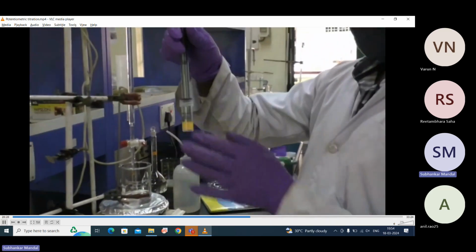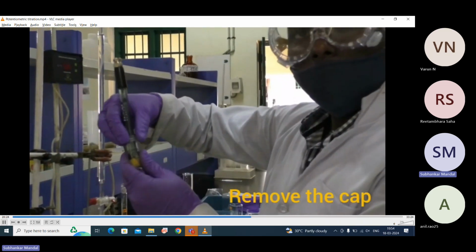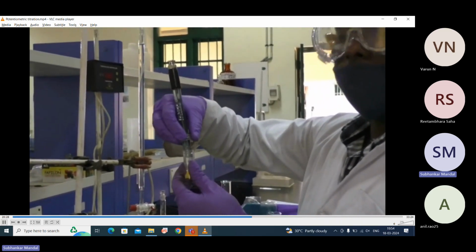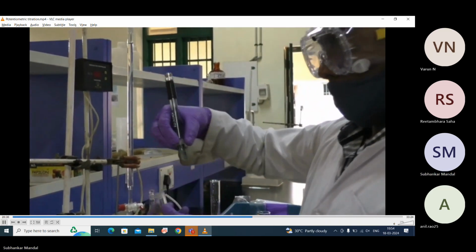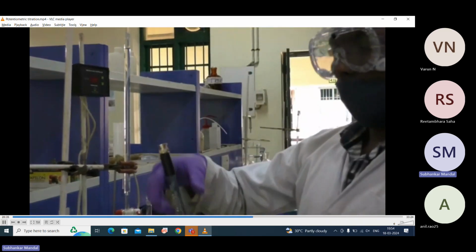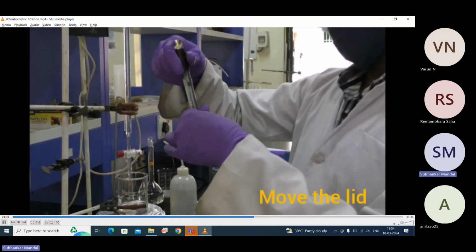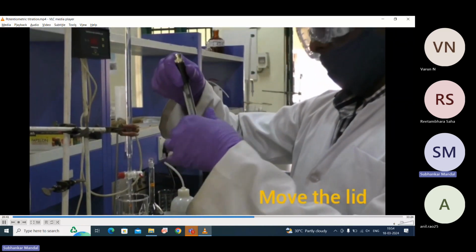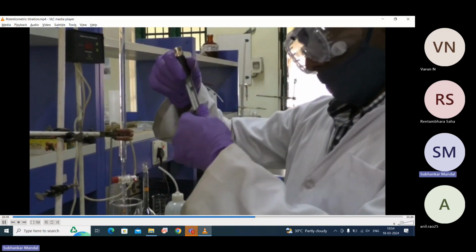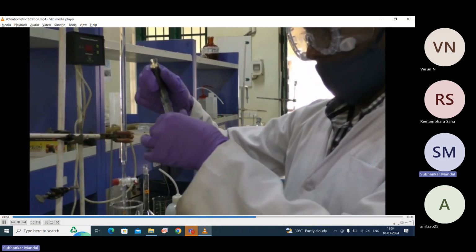So this is the electrode, the glass electrode we have discussed in the class. In the bottom part you can see a tube kind of thing, with a spherical glass electrode, which has an ion specific transport membrane.